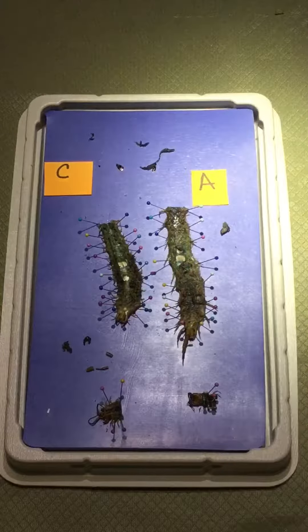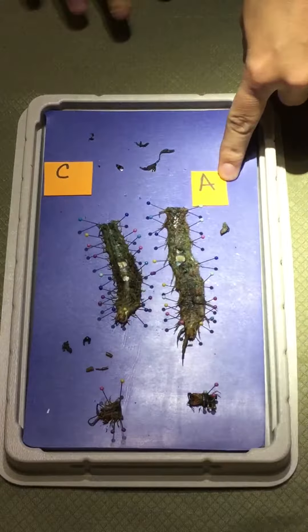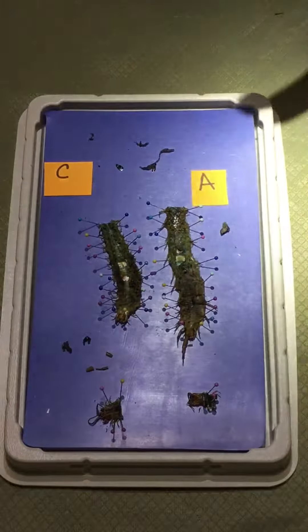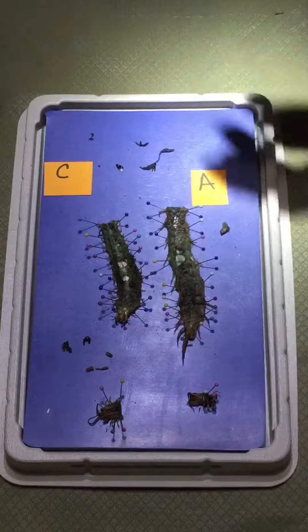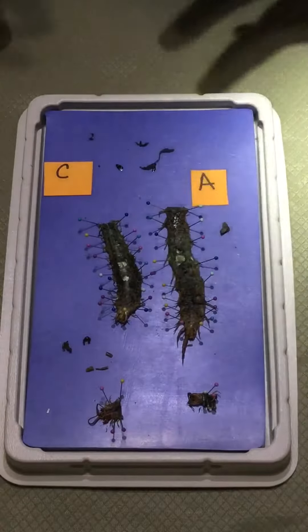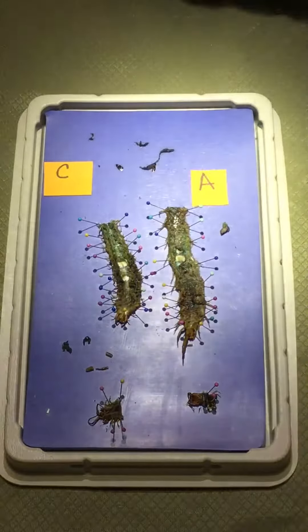Alright guys, so I'm back. I had dissected A in the first part of the video and now I have dissected C. You can't really tell the difference now, but when I cut open C it was a little bit fresher, so the tissue was better. I actually got a couple slides on the muscle tissue which looks pretty cool, so I would do that if I were y'all.